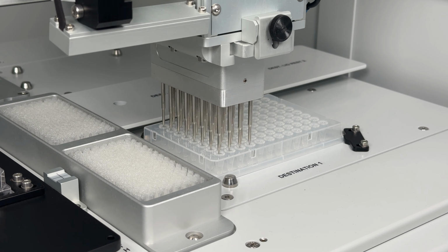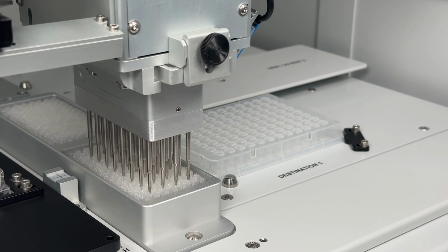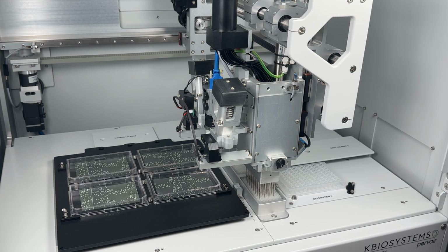Inoculating them at the end into a wide range of destination plates, such as microplates with 96 and 384 wells, in both shallow and deep well formats.